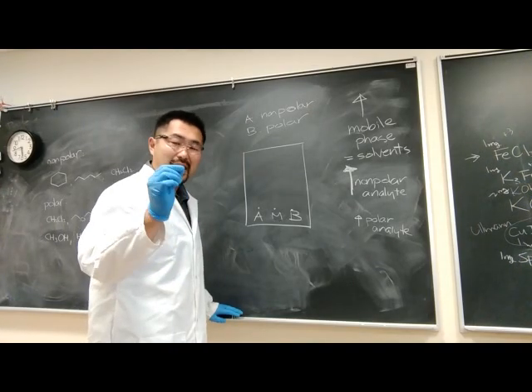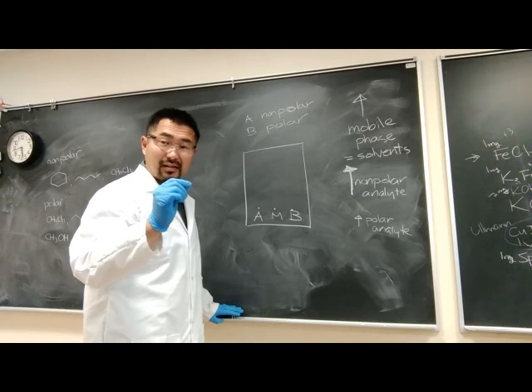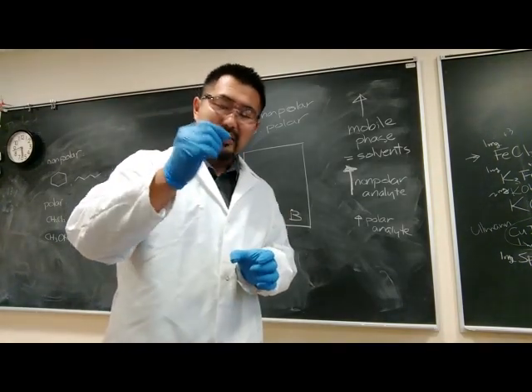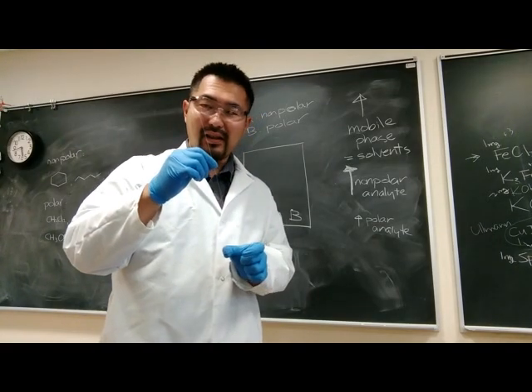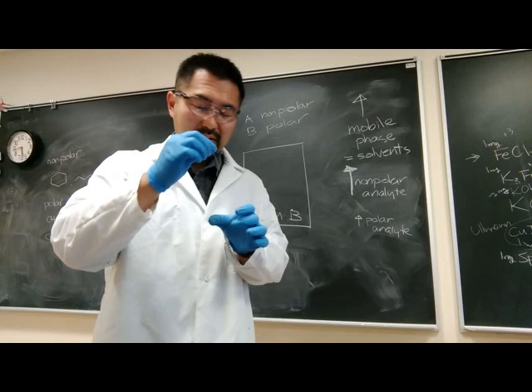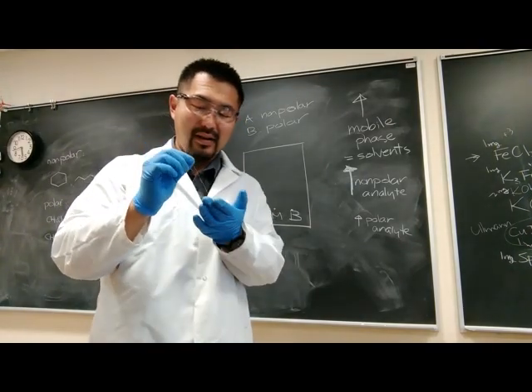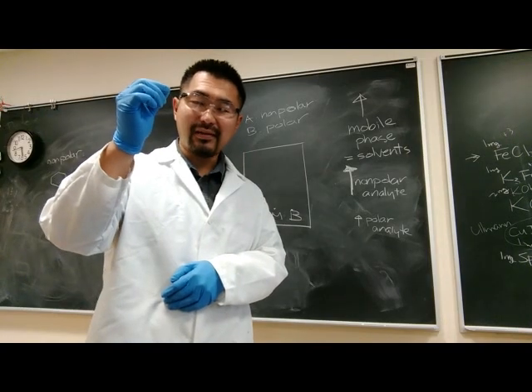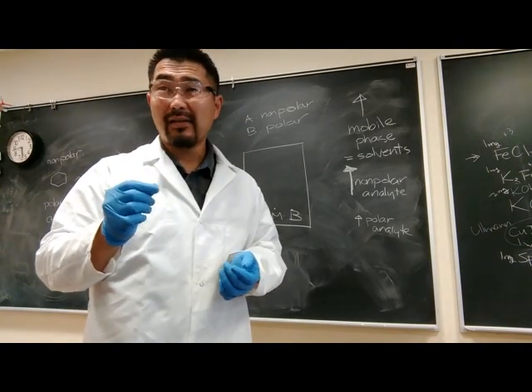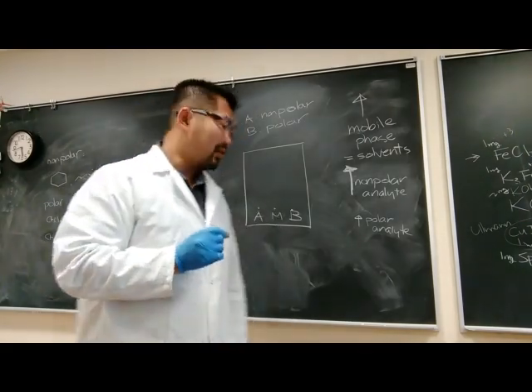And then I would clean the inside of the capillary with some acetone. To do that, you can just dip the tip of your capillary into acetone, maybe taken in a little beaker, and then you can spot out that acetone solvent that's taken up in the capillary onto, say, a paper towel or a Kim wipe, and that will sufficiently clean the capillary.